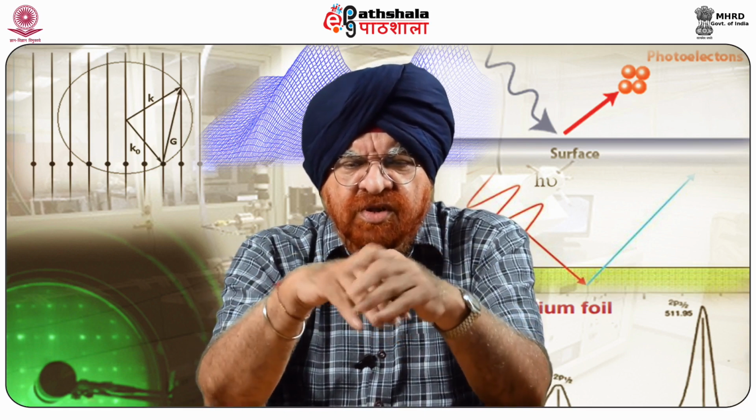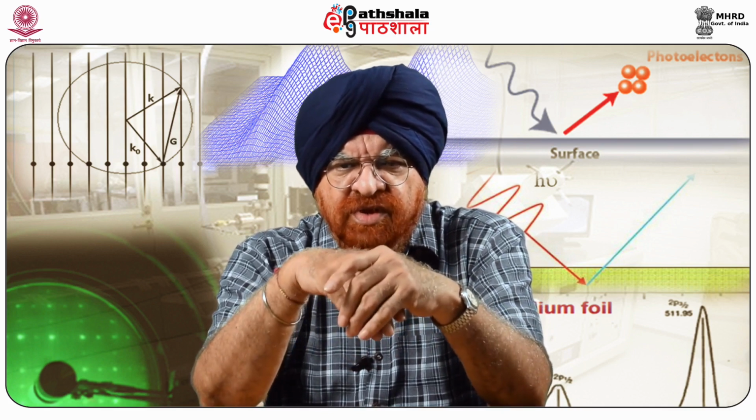Before either a crystal growth rate or adhesion force measurement, it is often good practice to regenerate the crystal surface by flowing supersaturated solution through the fluid cell to reduce surface roughness.